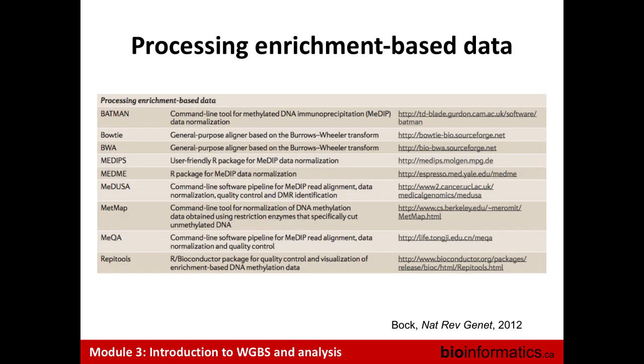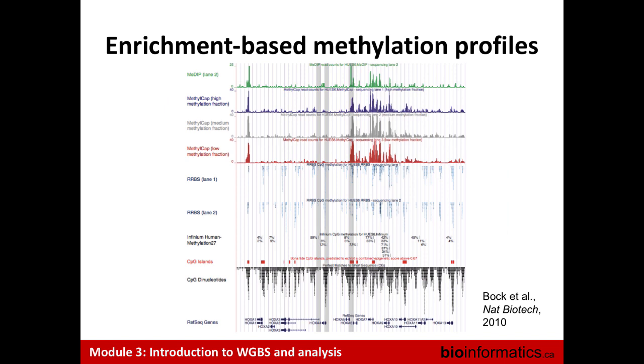So, again, I'm not putting too much emphasis on how to analyze these data, and each of those would be a topic on its own. There are tools specifically adapted to analyze these different types of data. Some are modifications of principles that were used for ChIP-seq, to analyze both the MeDIP and the MethylCap data and pull out the regions of interest.